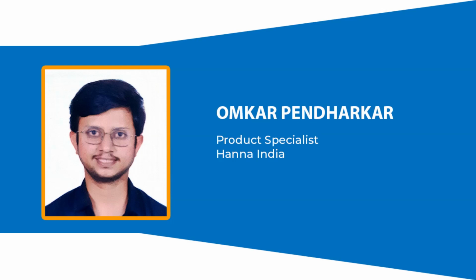Thank you for the introduction. So we will see the importance of titrimetric determination of hardness and alkalinity in the water quality and water industry.